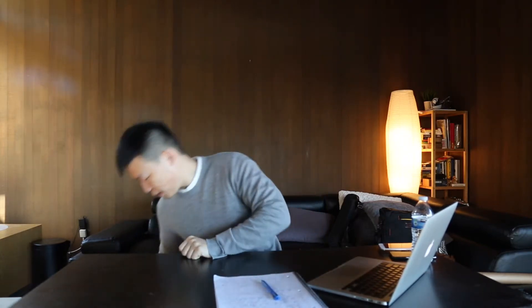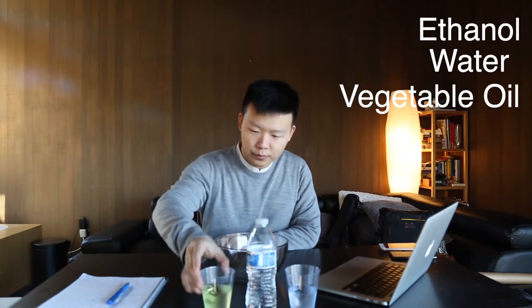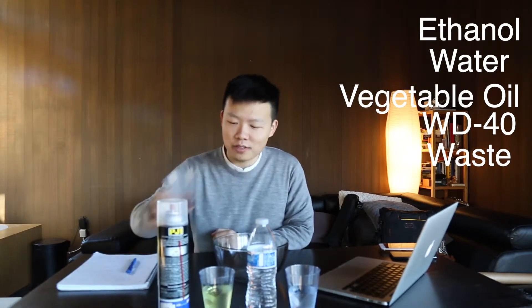I designed a small experiment in this studio using regular everyday materials instead of CBD and THC to demonstrate what distillation is. We have an empty glass bowl, and we have ethanol, water, vegetable oil, WD-40 — which is a synthetic oil — and what I'll call kitchen waste. Everything here symbolizes something in the cannabis industry.